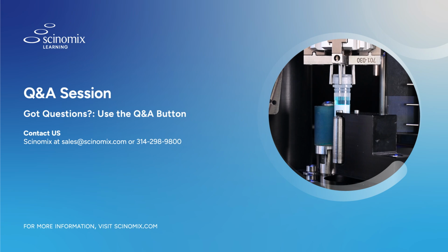Good. Yeah. And she said that they're about 0.25 mL in the fill. So the peristaltic pump should easily be able to handle that fill volume. Yeah, with great accuracy, for sure.